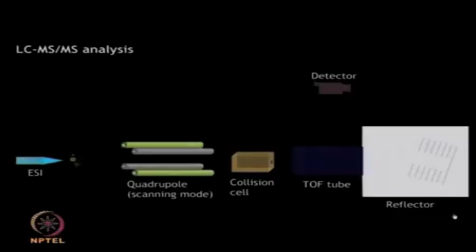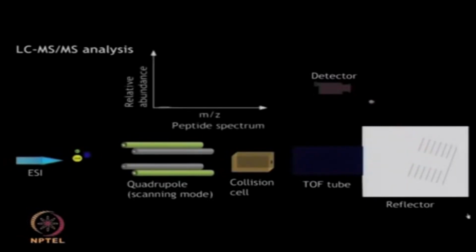The purified labeled peptide fragments can be analyzed by MS-MS. The different masses of the reporter group allow the peptide fragments to be identified. The reporter group is lost during the fragmentation step. The relative quantification of 4 samples or 8 samples can now be performed in this way.